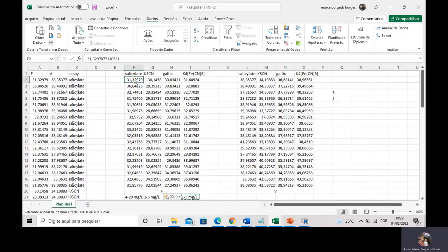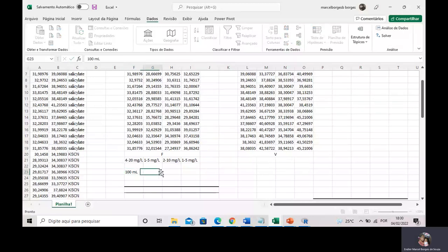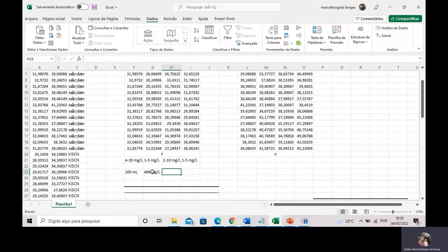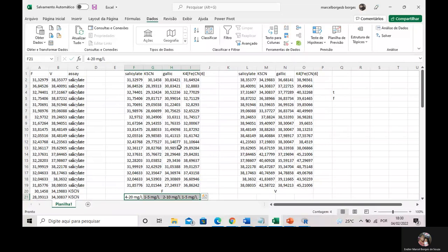I have prepared the samples. I take a dietary supplement pill and boil it in diluted nitric acid to oxidize iron(II) to iron(III). I have a very concentrated iron solution because one iron supplement was dissolved in a 100 mL volumetric flask, giving approximately 400 milligrams per liter of iron — very concentrated. So I have to dilute my sample solution to analyze it using different colorimetric assays.